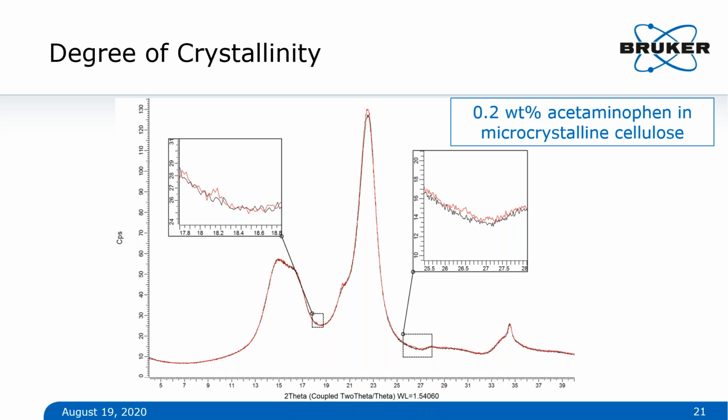But if I look at this region here, say around 18.5 or 18.6, what I could do is define an upper and lower threshold for noise, take half of that value, and then do a calculation for signal to noise. Typically speaking, guidance is, whether you're looking at limits of detection or limits of quantification, so LOD or LOQ, would be either 10 to 1 or 3 to 1, depending on what you're looking at.